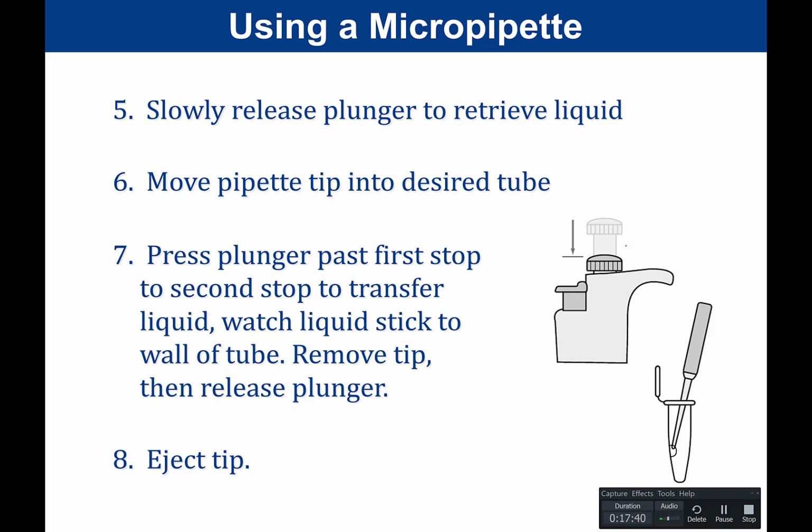If I still have my tip in the liquid and I push all the way to the second stop and I'm still in the liquid and I release my thumb, it's going to draw the liquid right back out. So it's really important that you push to the second stop, you get all the liquid out of the tip, take your pipette out of the liquid, and then release your thumb. And then you can eject your tip into a tip waste container.